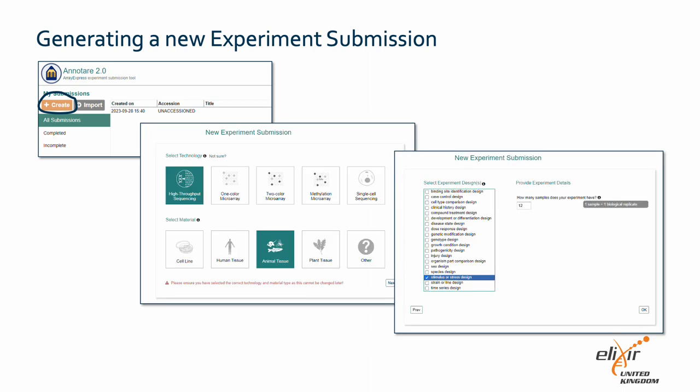A pop-up will show where you can indicate the type of experiment you wish to submit. In our example, the technology is high-throughput sequencing and the material is animal tissue. When you click Next, a new window will appear where you can identify the experimental design. In our example, we compare the effects of different diets, so we select 'stimulus or stress design.' Indicate how many samples you will be submitting — one sample is one replicate. In our example, we have three experimental conditions and four replicates per condition, so we will be submitting 12 samples.